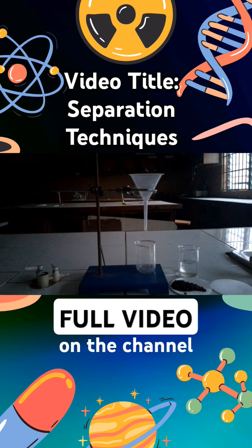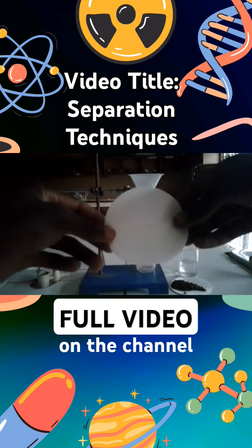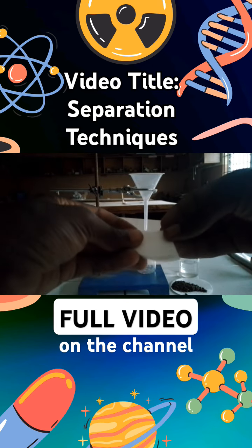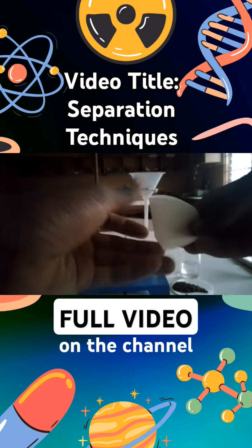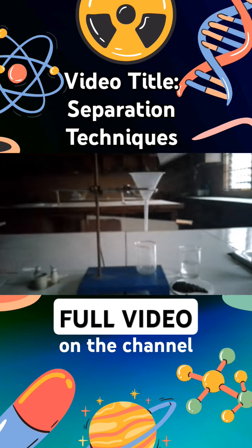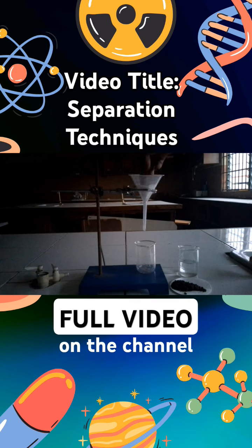To start with, we are going to pick up this blank filter paper and fold it into 4. As you can see, I'm going to give it the first fold. So this is the first fold. Then I'm going to give it the second fold. So this is the first step. Now, as you can see, this has been folded into 4. The next step is to insert this into the funnel. So I'm going to insert this filter paper that I've folded into 4 into the funnel and make sure that it is sitting inside the funnel.